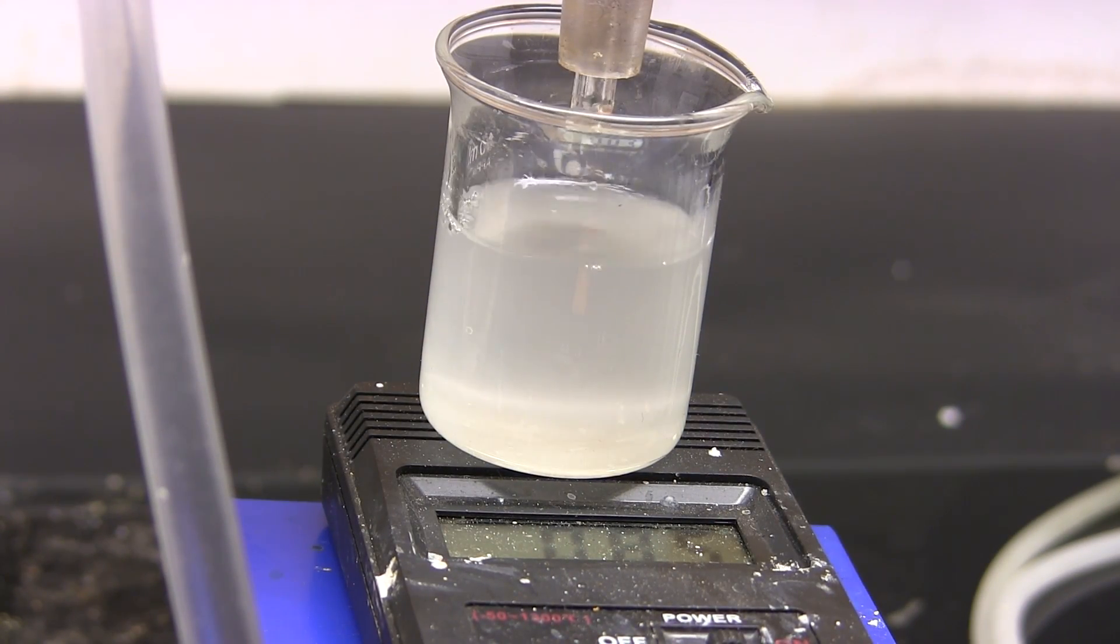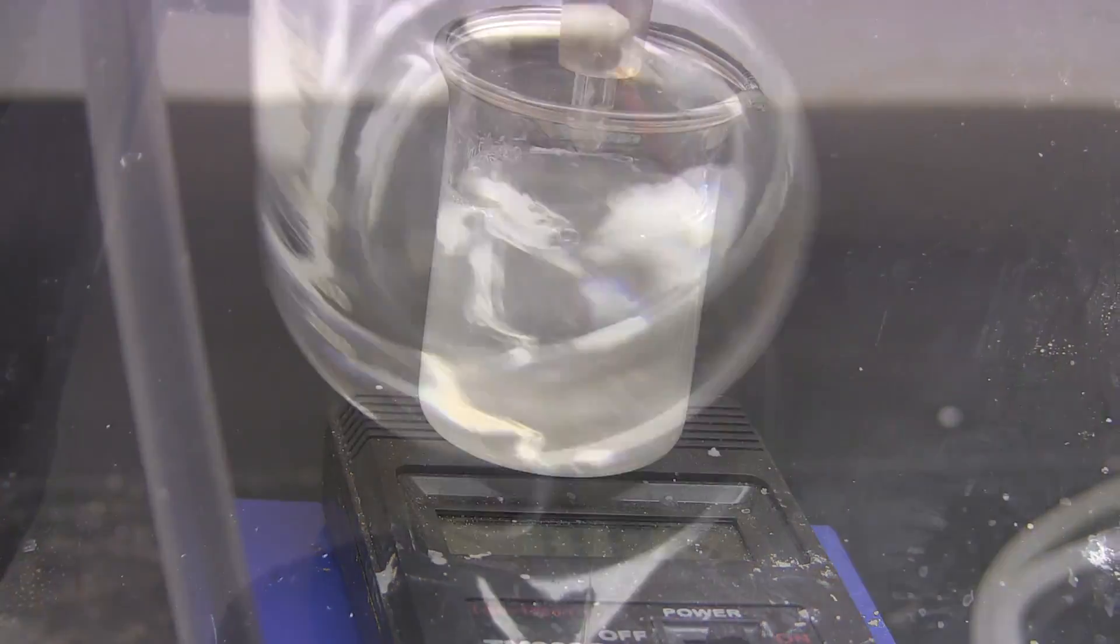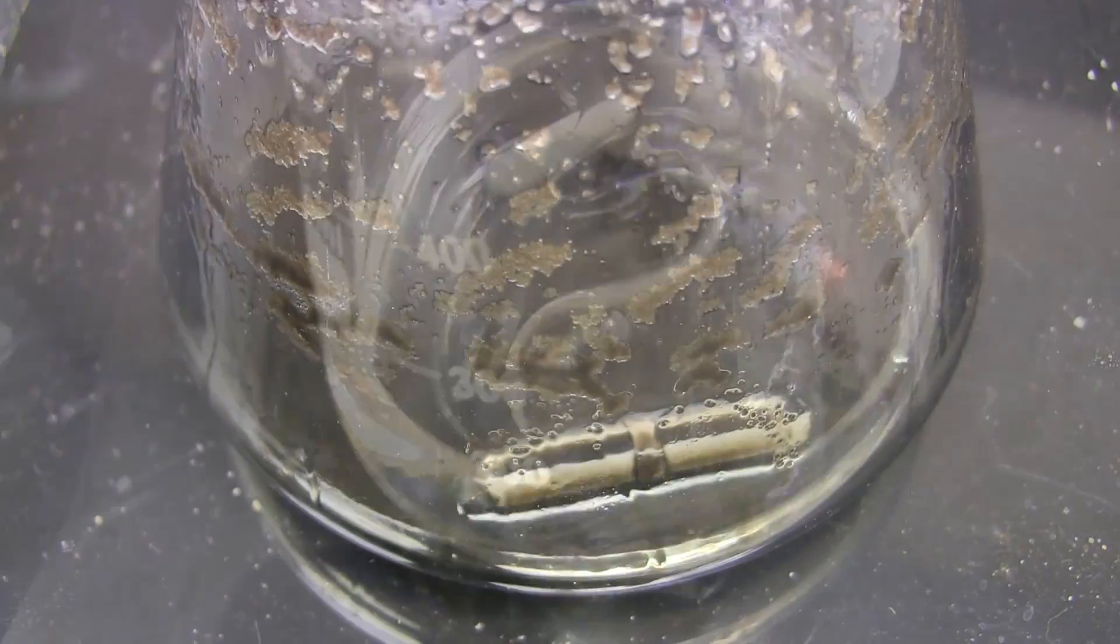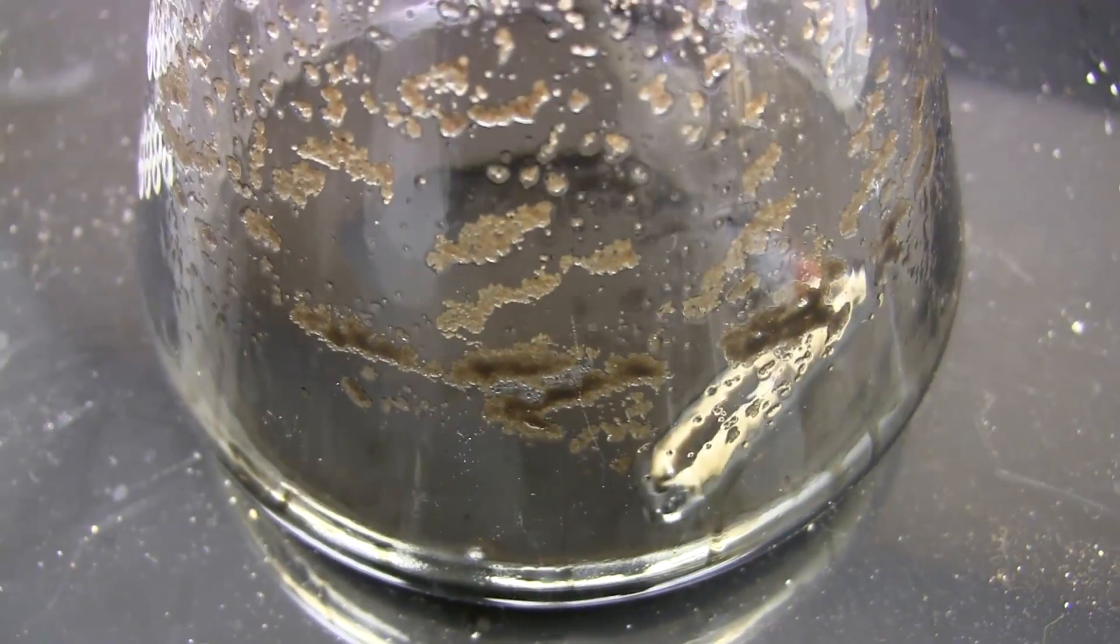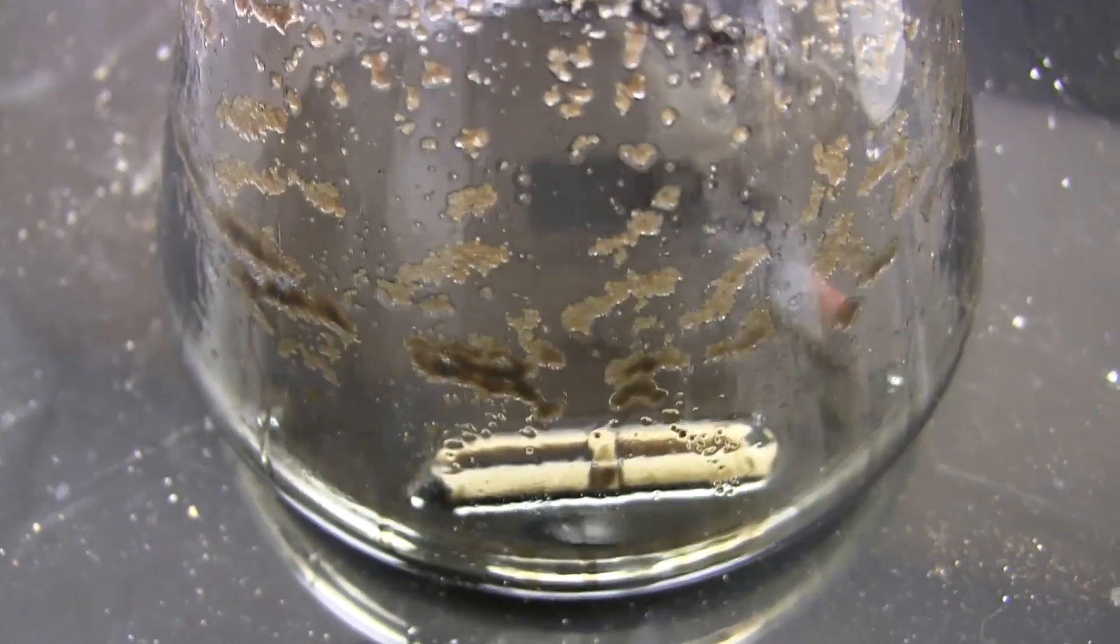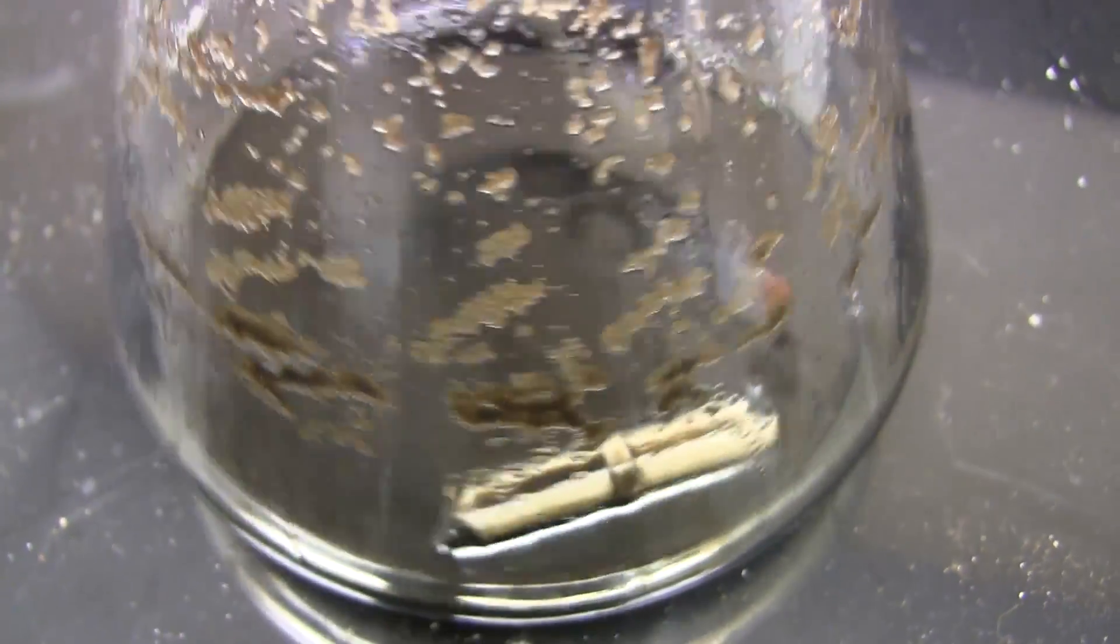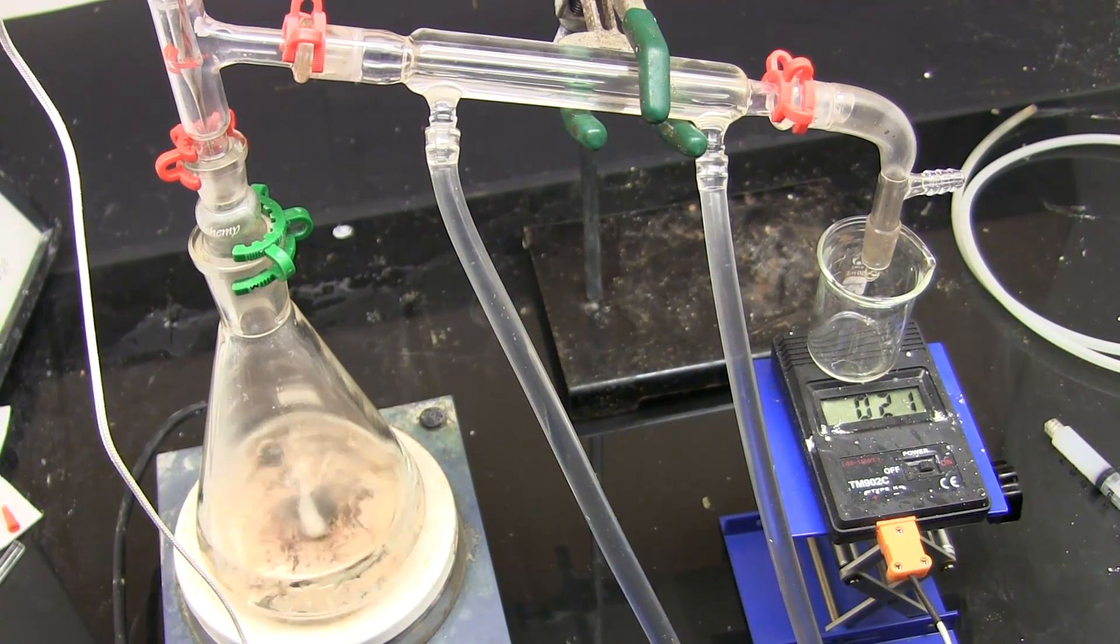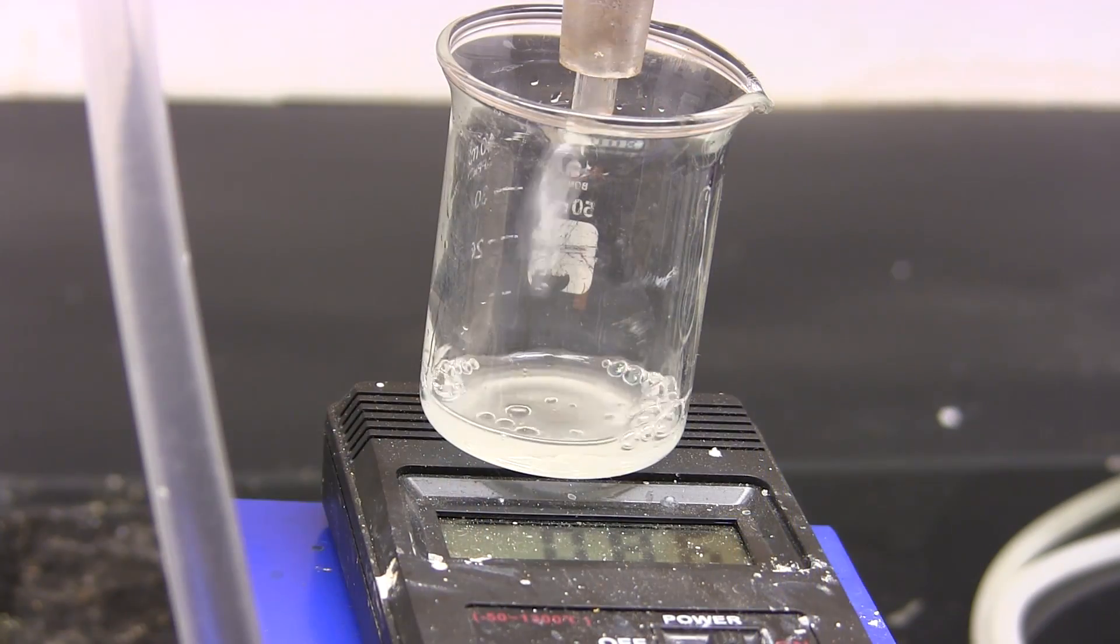Now you might ask why we don't simply use a separatory funnel and while this is certainly the way to go if the mixtures are simple and easy to separate, sometimes you have to deal with complicated sludges, tars, emulsions, viscous gels and other heterogeneous mixtures. A separatory funnel isn't going to do much if the components just don't separate.